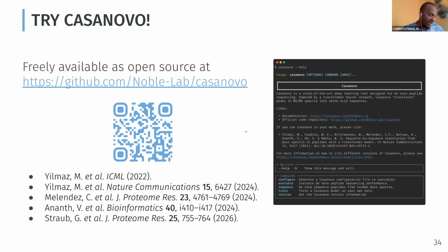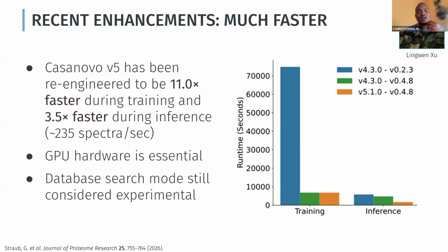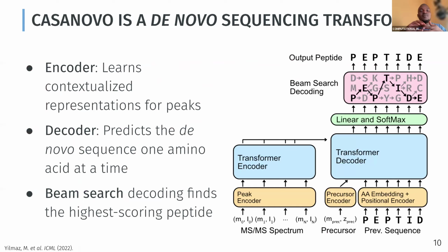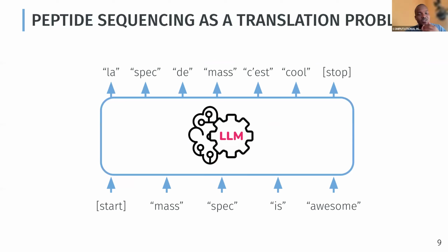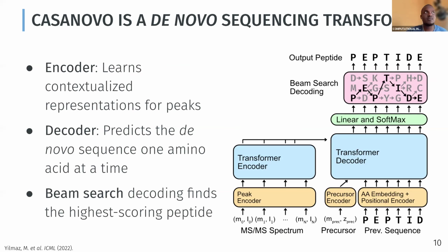And somewhere, I hope I didn't misquote you, you're saying you're taking the peak values within the spectra. And I ask myself, isn't there data loss, and how does the transformer in this sense compensate for that loss, if it is there, to make the perfect prediction of the sequence? How do you cater for that, if at all it happens anyway?